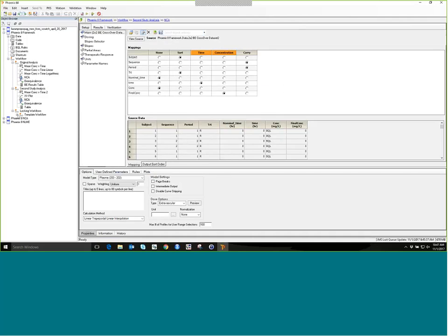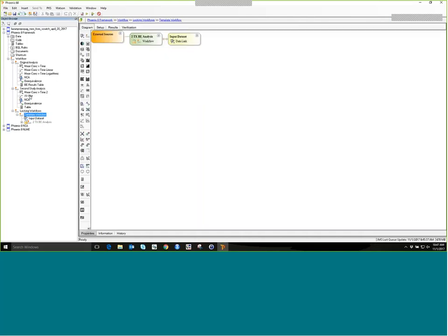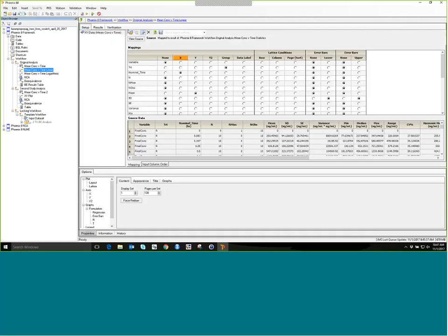So the other piece that is useful is locking work. Oh, actually, let me go back. I forgot to show you how you save a setting. If you want to save a setting, you have a graph the way you want it. You can simply click this little save button up here by object settings, and you can save it, and then you can write a name. You can also replace a setting. If there was an existing setting, I think this was the linear graph, and I just want to replace it, I can save it as the same name, and it's going to now update the settings. So I'll go ahead and update the settings. If I want to save it as a new setting, I can just type in the new setting name, and then it will save it, and then the new setting is now available to me to use.